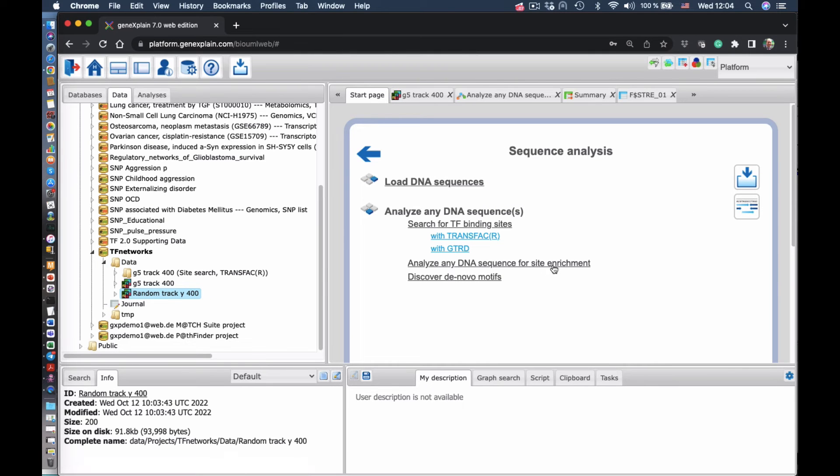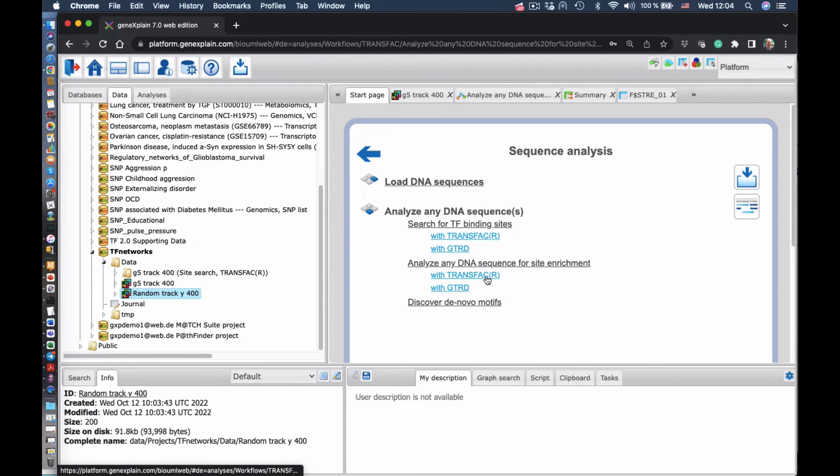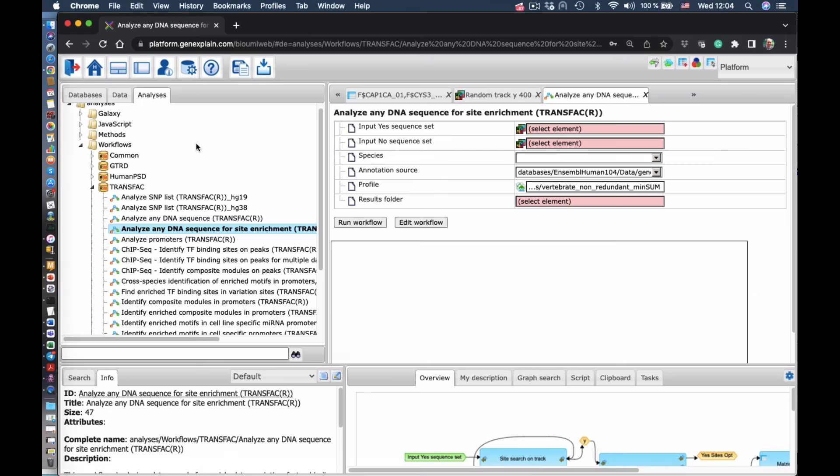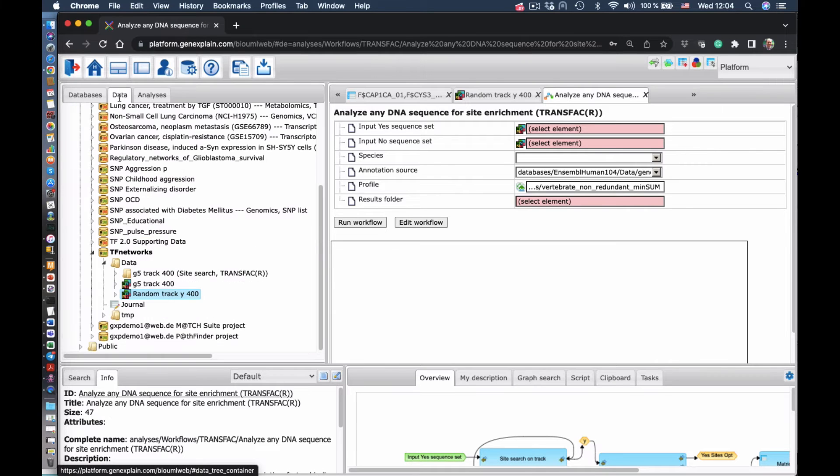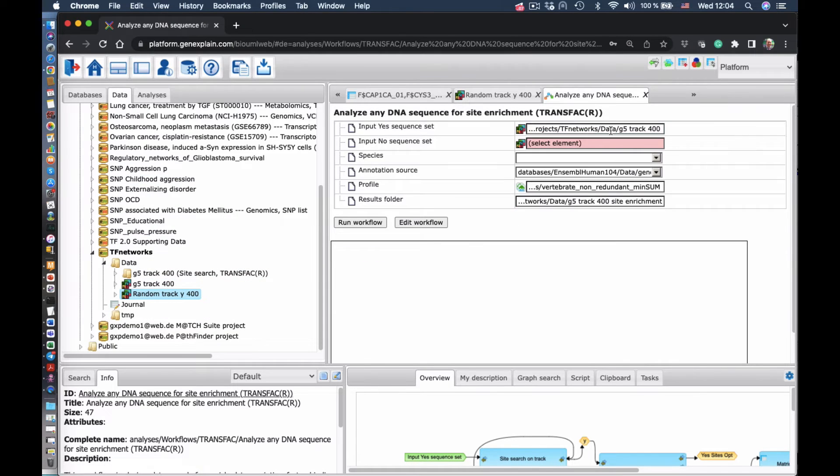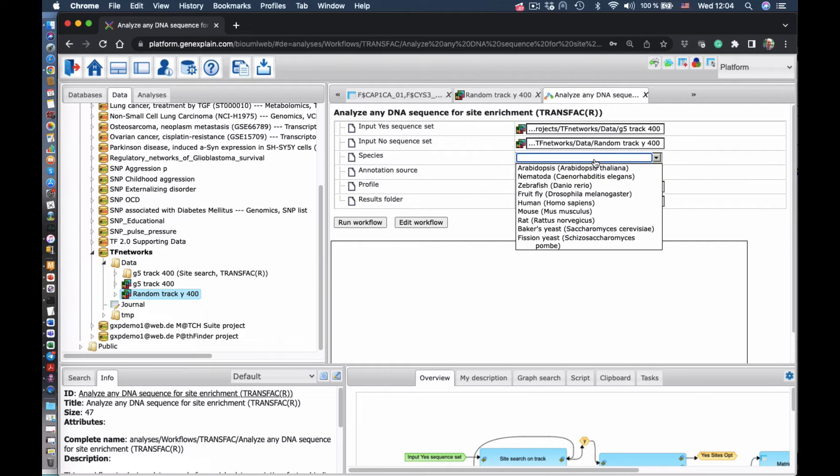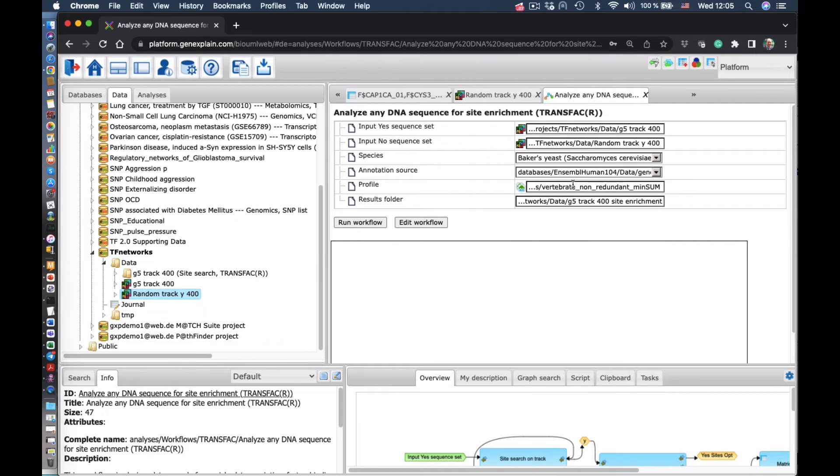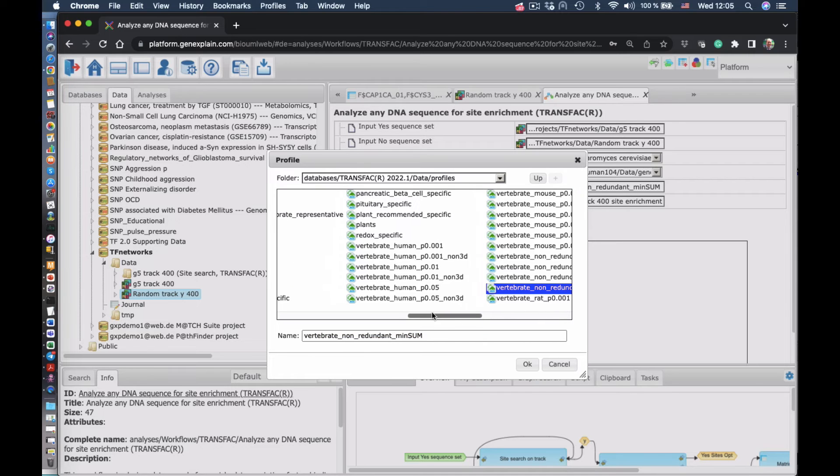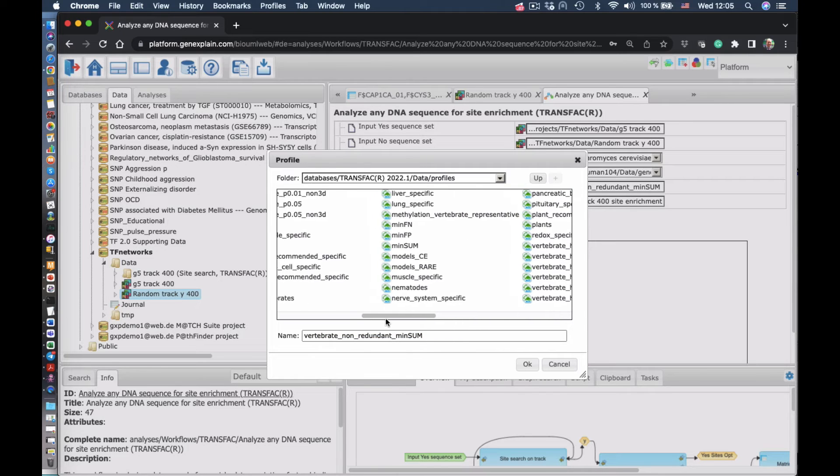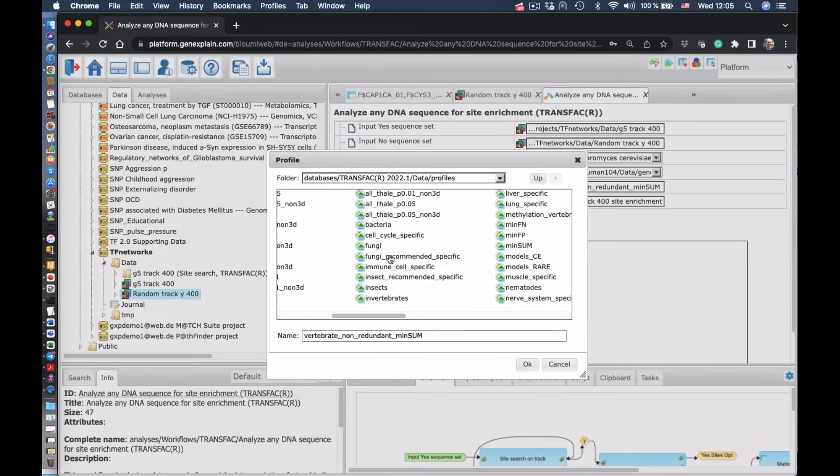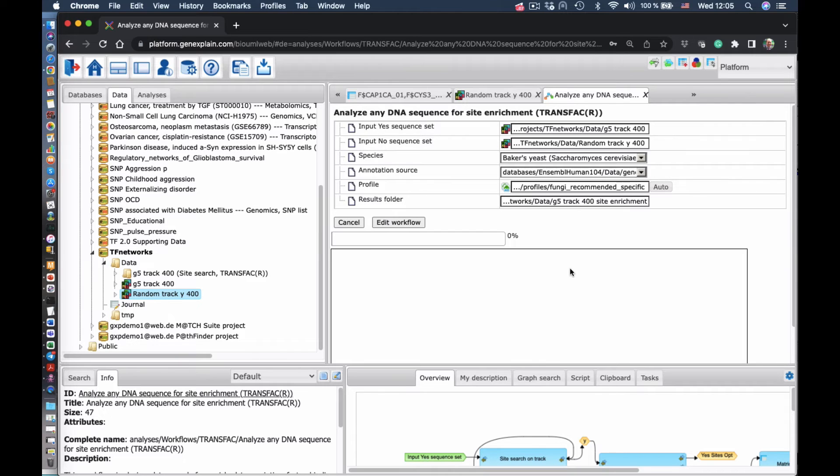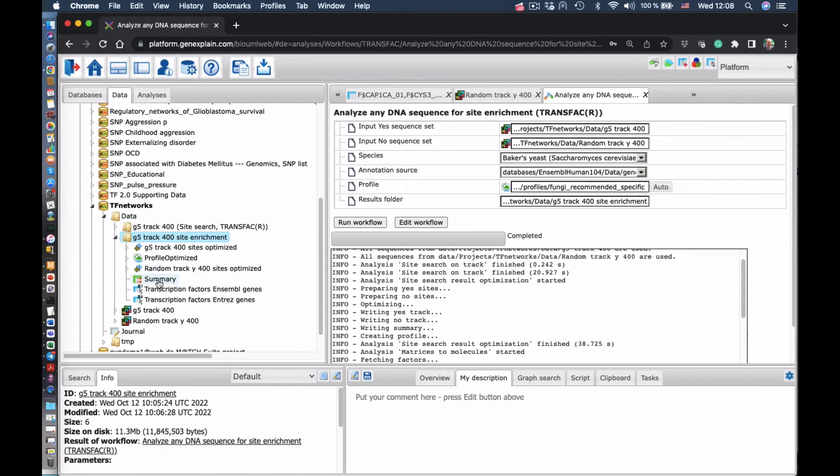And now we start this site enrichment program. And now in the site enrichment program, we have to put the sequence itself and the background set of sequences. We have to select the respective species and select the set of matrices, which is fungi-specific matrices. Now we run the enrichment analysis.